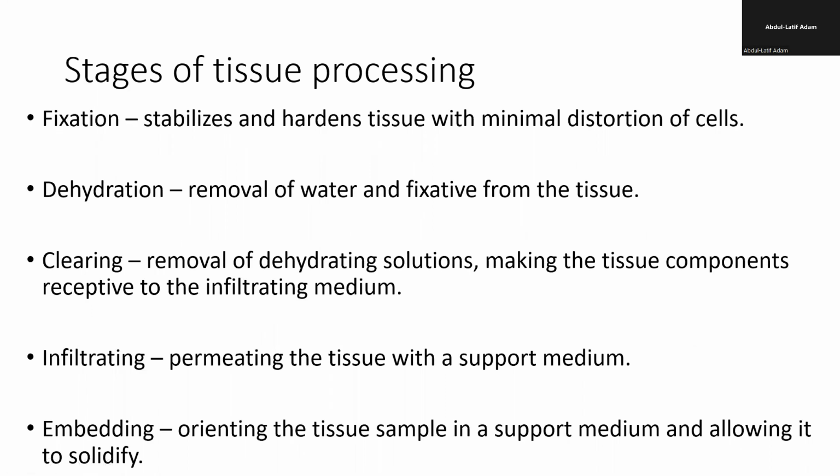As I mentioned to you, ideally, processing starts from dehydration, but because sometimes the tissue gets to the lab with incomplete fixation, a bit of fixation is done before the tissue is finally dehydrated.